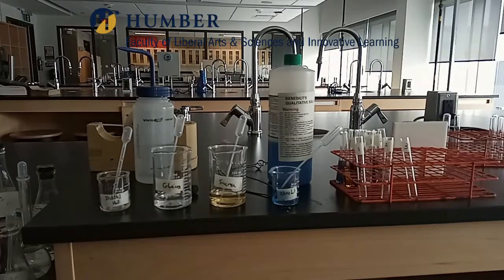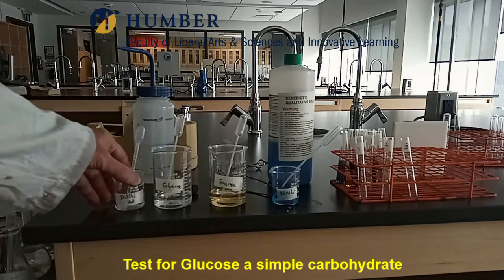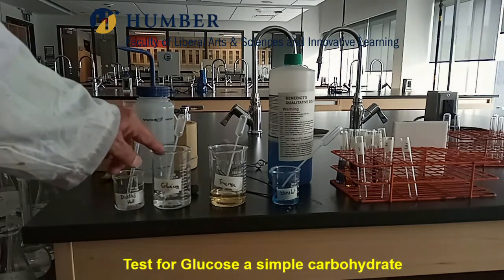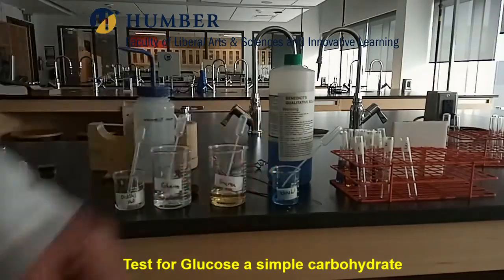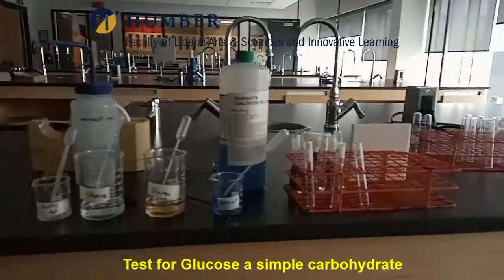So this is a test for glucose, a simple carbohydrate. I have distilled water, I have glucose, I have sucrose, and I have Benedict's solution. I have labeled test tubes 1, 2, and 3 as well.